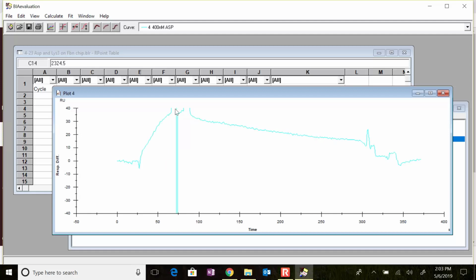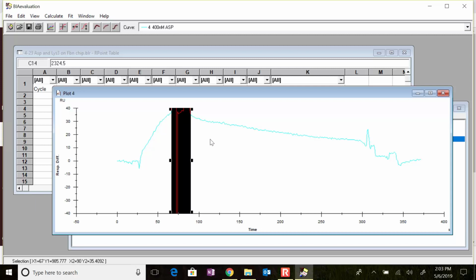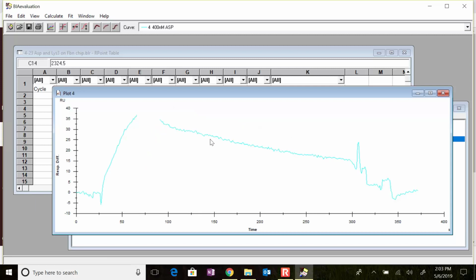And so we can sort of see, it looks like this is good data. And so what I'm going to do is, again, right-click select, and I'm going to go through to the end of the data. I'm just going to Control X. Now once it's gone, it's gone. I want to undo that. This doesn't have very good undo functions.